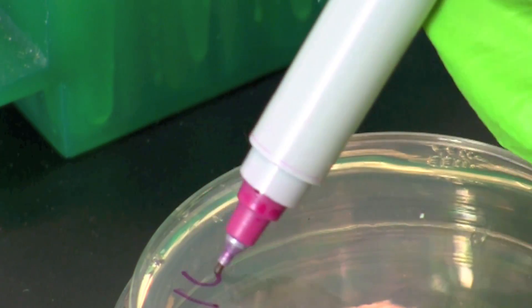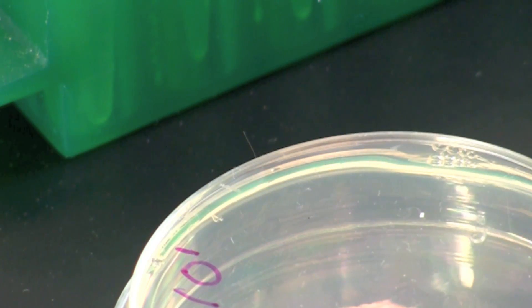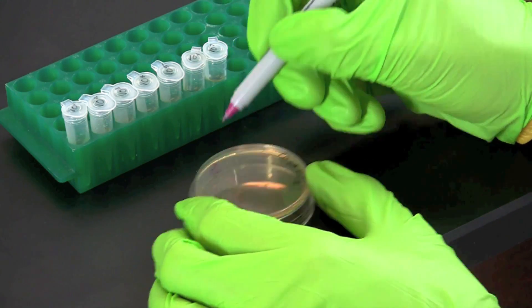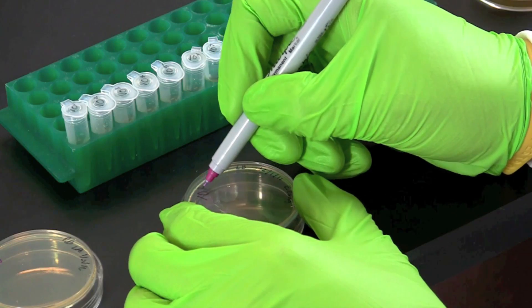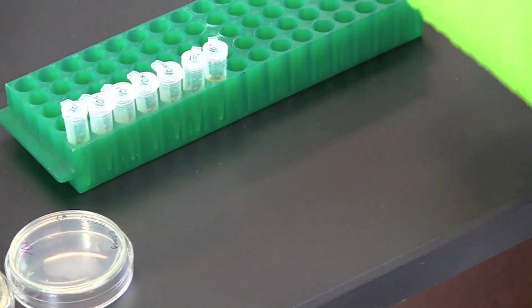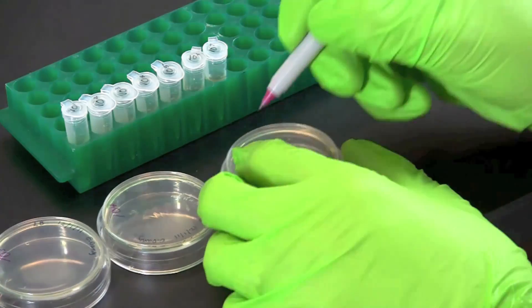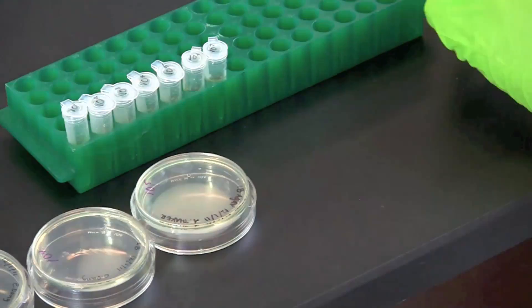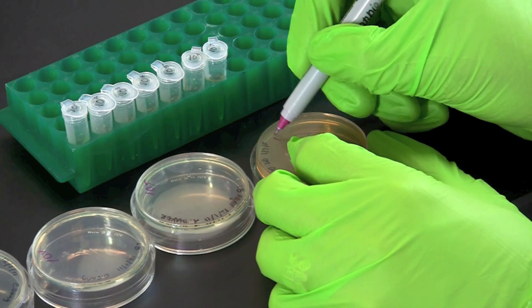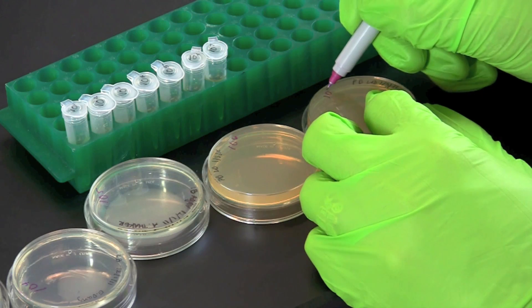Next label 7 LB agar plates on the bottom edge with the dilution factors: 10 to the 1st, 10 to the 2nd, 10 to the 3rd, 10 to the 4th, 10 to the 5th, 10 to the 6th, and 10 to the 7th.